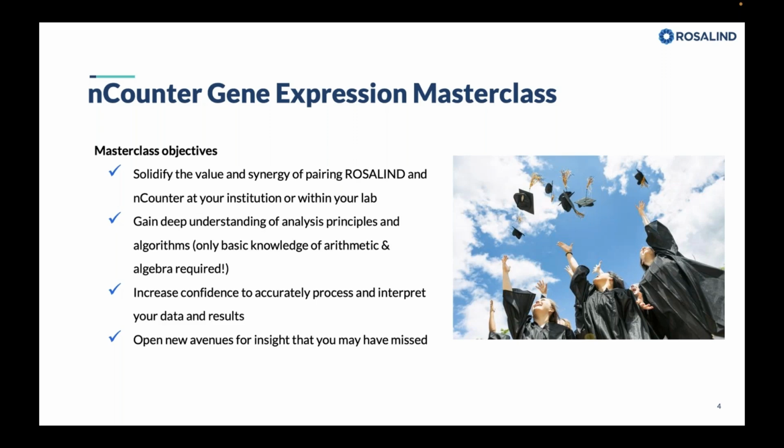I want you to have a deep understanding of the analysis principles and algorithms. So today we're talking about pathway analysis. In my experience, there's a lot of confusion about what those GSA scores mean for nCounter. How do I interpret them? What do they mean? So I want to show you the math behind them. It's actually very simple arithmetic.